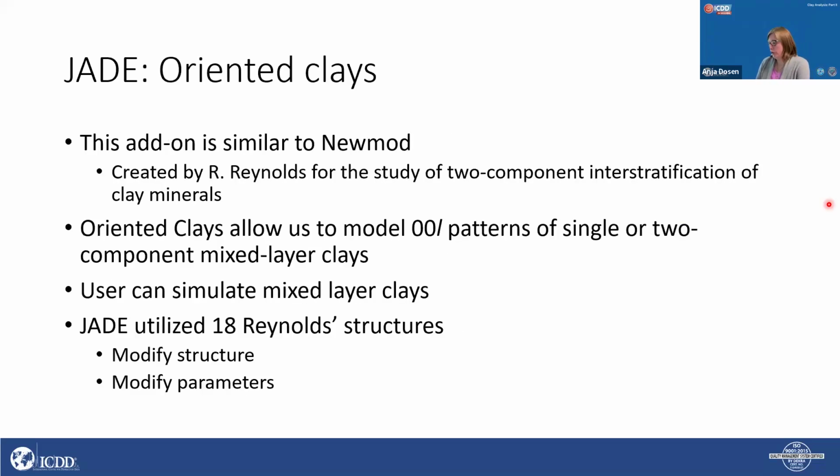So what I want to talk to you about is the oriented clays add-on. This is a very cool feature where you can model the clays. This is similar to NewMod. If you're familiar with NewMod, that's a program created by Robert Reynolds for the study of the interstratification of clay minerals.